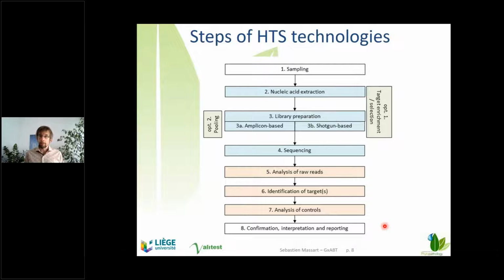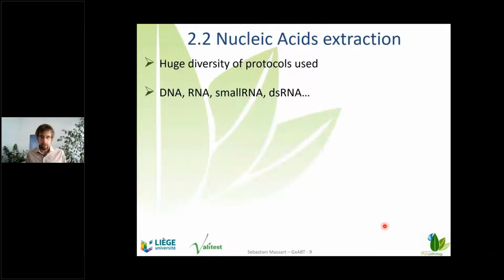So that's for the sampling. Same as before, but keep in mind, it's always a complex mix of organisms. Okay, let's have a look at the second step, nucleic acid extraction.